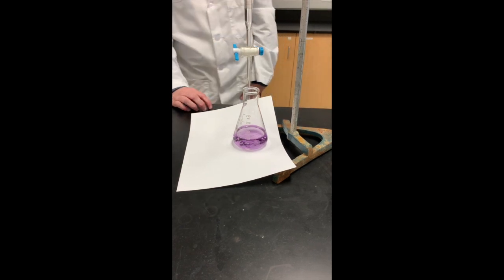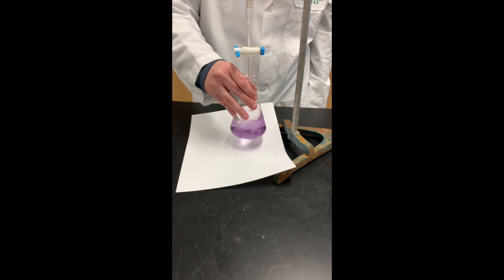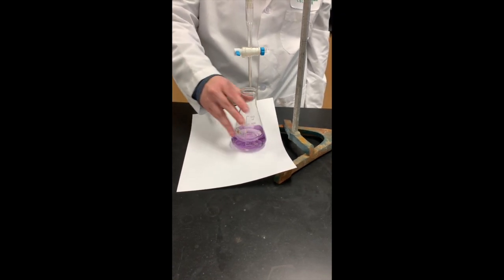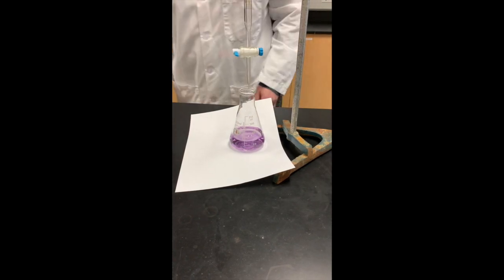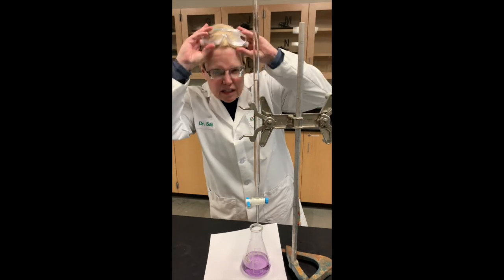And that's probably about as blue as that's going to get. I know it looks a little purple, but with the volume change, it doesn't really change too much. So we'll go with that. And we've got that at 28.6.